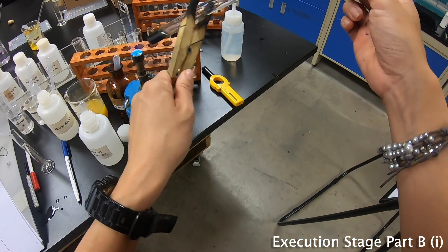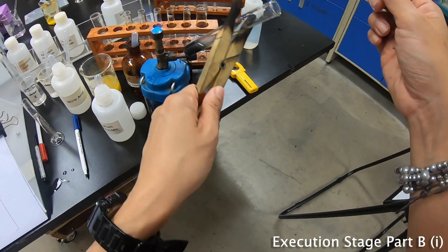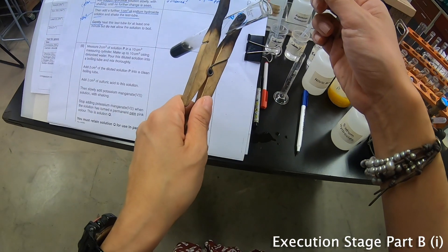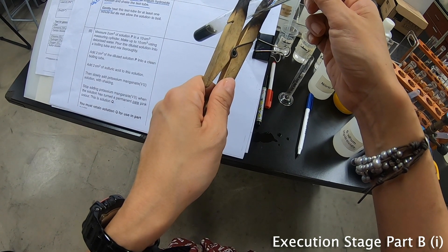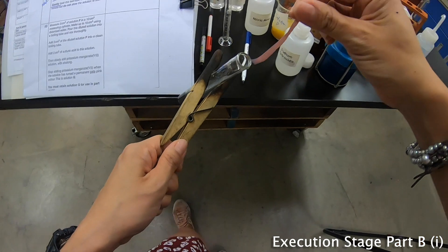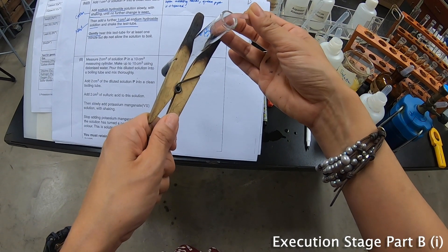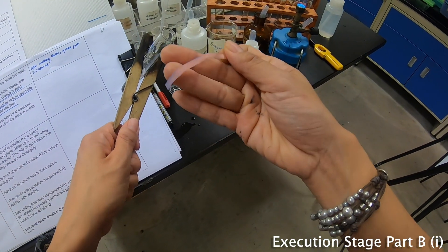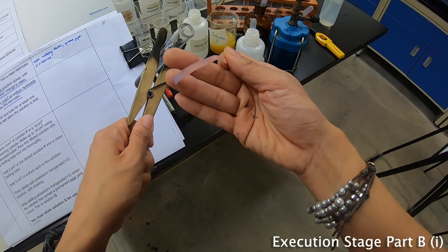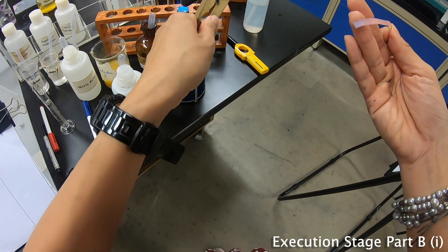What I always advise students: bring the test tube across over here and dip your litmus paper inside and wait. I can see the red litmus paper slowly turning blue. I can heat some more to have a more obvious reaction.